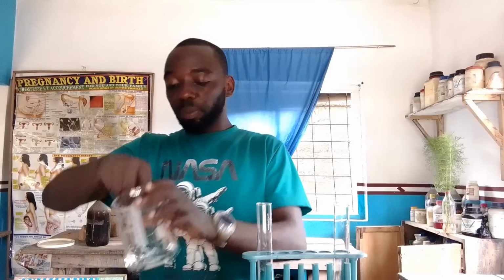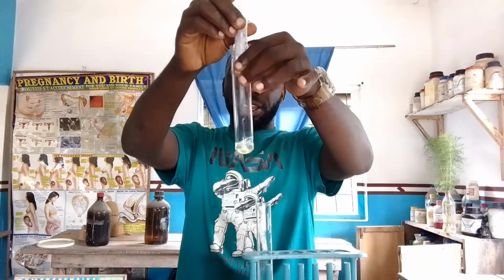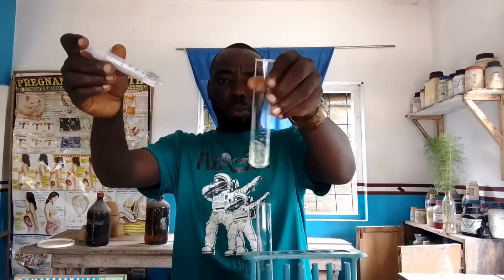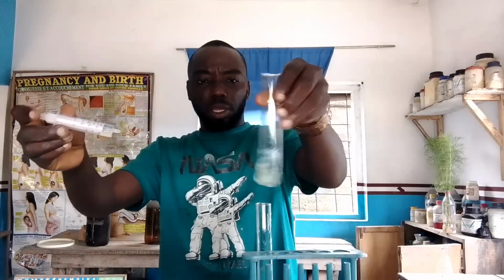Now at this point I'll be using this to take some amount of this and put right inside here and shake it. And shake.